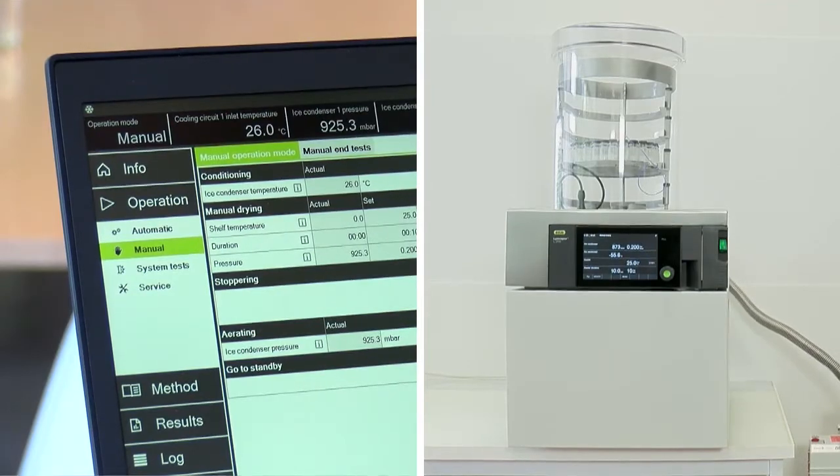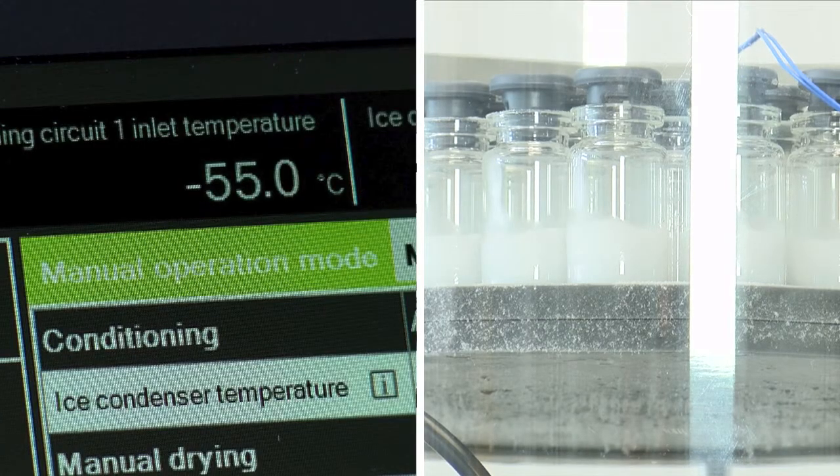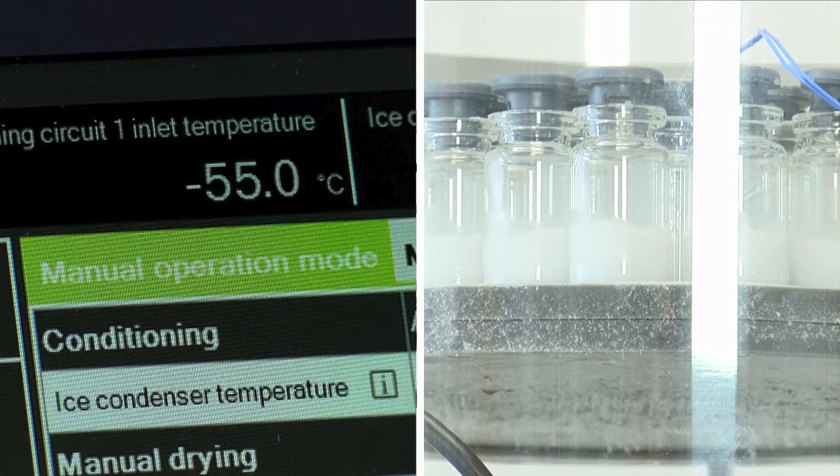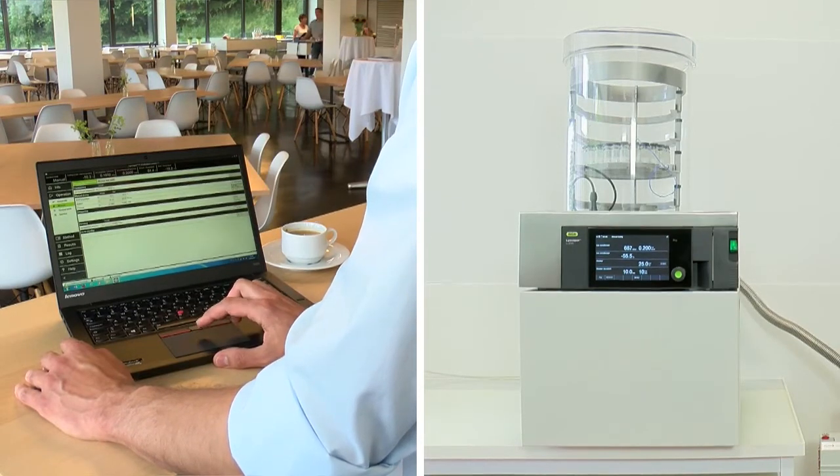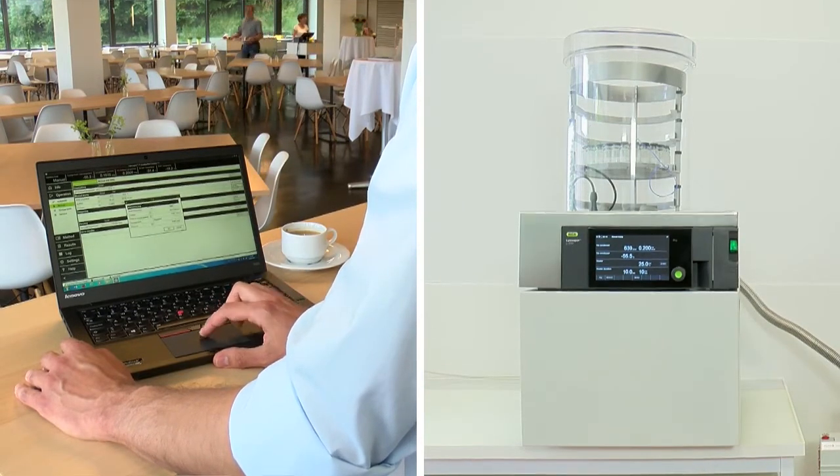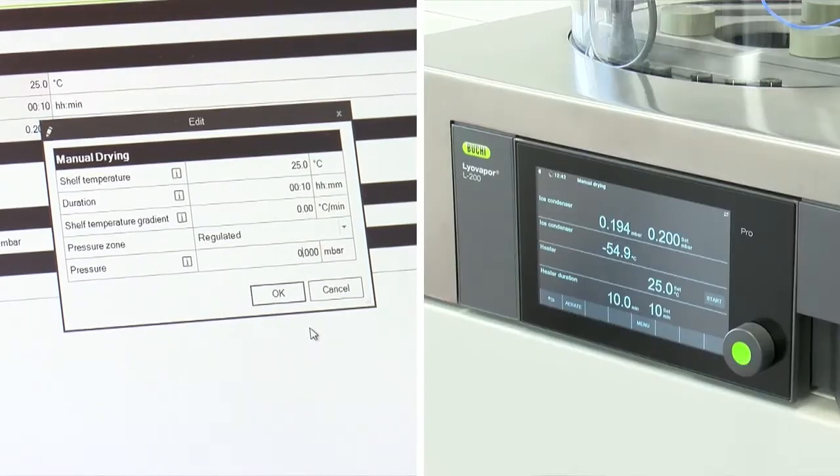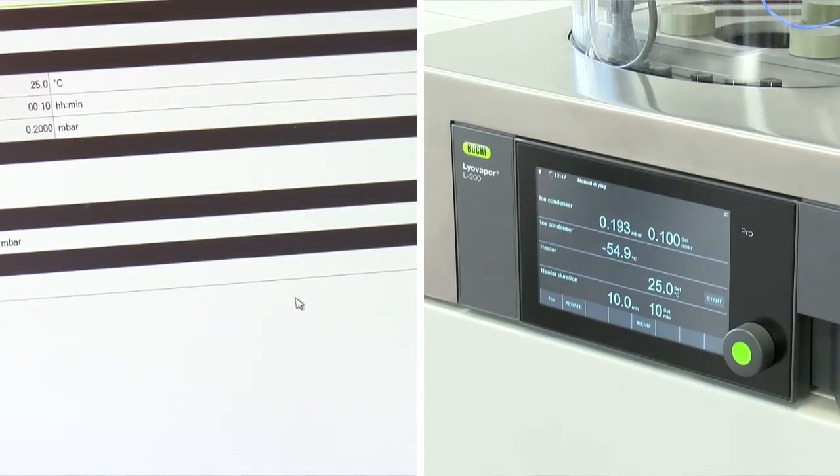Once your sample has been loaded into the freeze dryer and you have started the freeze dryer run, it's easy to closely monitor the process conditions with the software and, if necessary, you can change the settings of your cycle, for example, pressure or temperature with the software during the run. So this gives you infinite control.